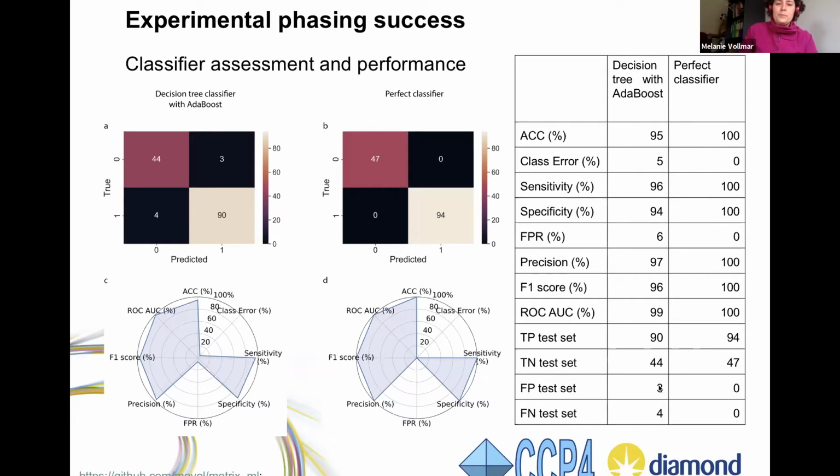In order to see how good that really is, I went off to one of my users and asked them whether they could provide me with some data that they recently collected, which is unpublished, so there's no risk that it is in my training data. They just tell me where the data is, I run my analysis pipeline and the prediction on it, give them the results, and they tell me whether I was right or wrong.